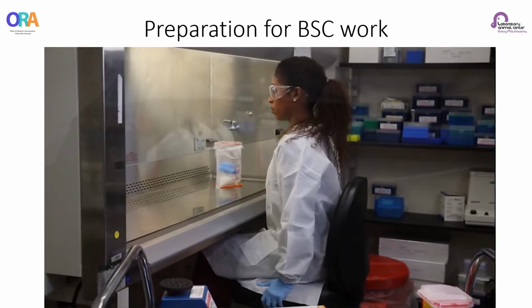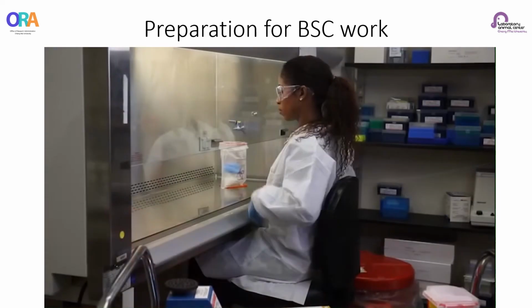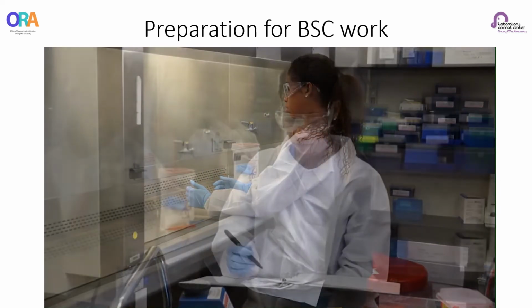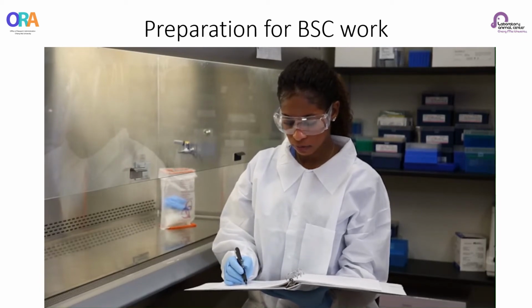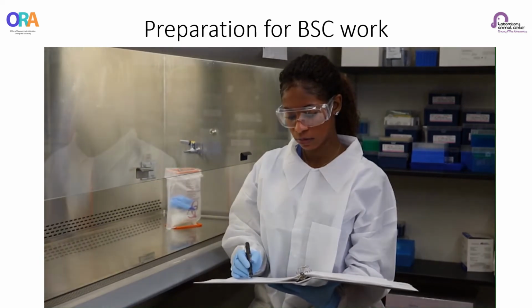The stool or bench should be adjusted to ensure that your face is above the sash opening and that your armpits are level with the bottom of the sash. As a reminder to perform these tasks, a BSC checklist may be used according to your lab's protocol.